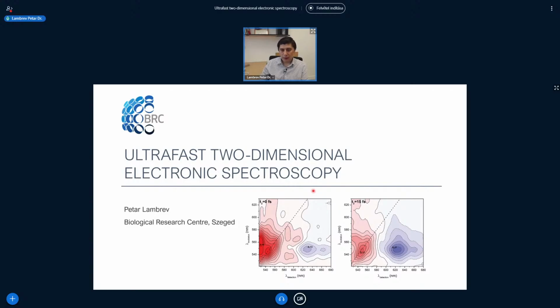Now, this is an ultrafast technique, obviously, that was invented maybe sometime around 20 years ago, but since then has very rapidly gained popularity in the research communities in photochemistry, photobiology, and especially in photosynthesis, which is the area of our group research. So I will be giving references to photosynthesis throughout this presentation.